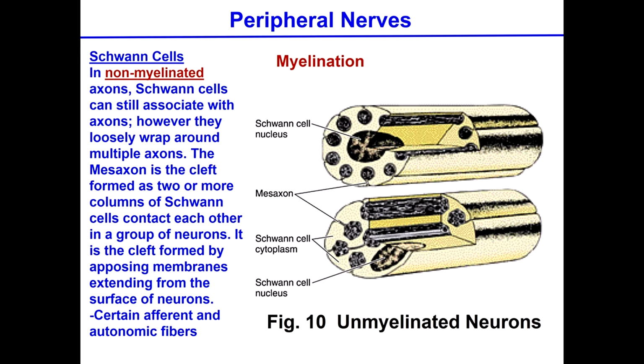Now that doesn't mean that every single axon is myelinated, but this is the unmyelinated neurons. As I mentioned before, they also have Schwann cells around them, and the difference is that they do not wrap around them so many times. They do not form the myelin structure. They keep having protective roles, and look at these things here, the Schwann cells, and this is the nucleus.